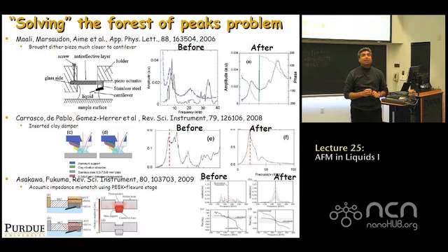The third approach is to use photothermal excitation. That's very popular these days, especially the frequency modulation people are really doing this, where they use a blue laser to periodically heat a cantilever directly and make it oscillate. It makes your AFM look very cool because there's a blue glow about your AFM. But on the other hand, you also have to be concerned about the cantilever heating up itself under this laser. So no clear method has come up yet.